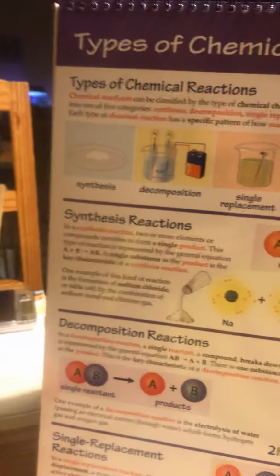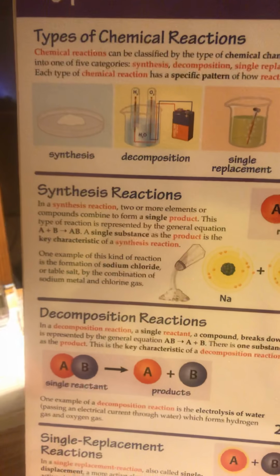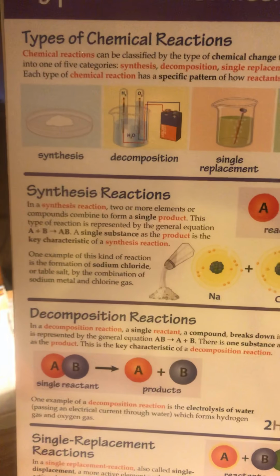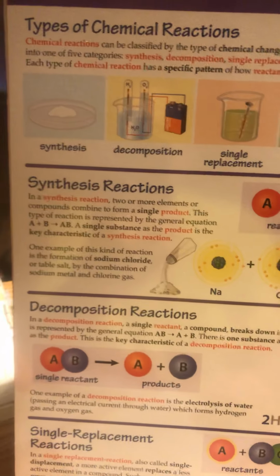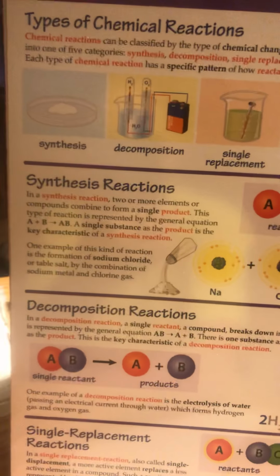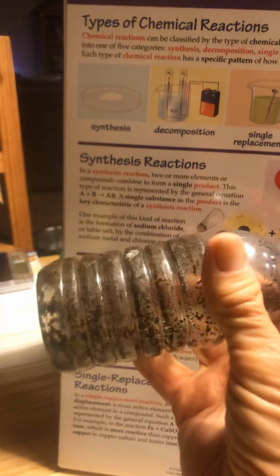Hi everybody, John Walker here, your science teacher, and we're going to go back to one of the labs that we did the other day, yesterday actually, and we're going to take a look at the results when we put iron filings into this bottle, and we put a little water in there with it.